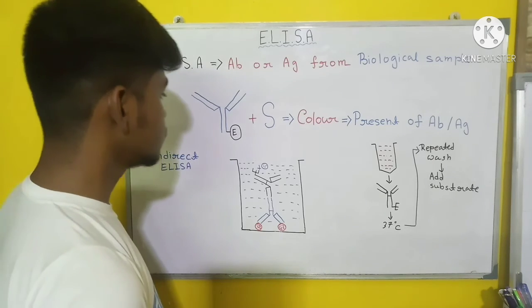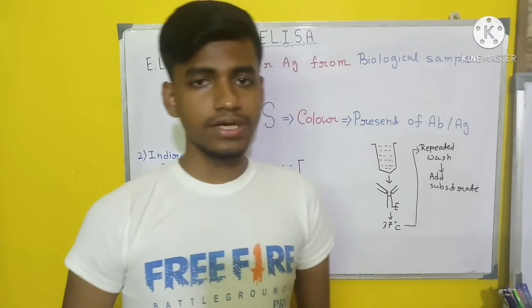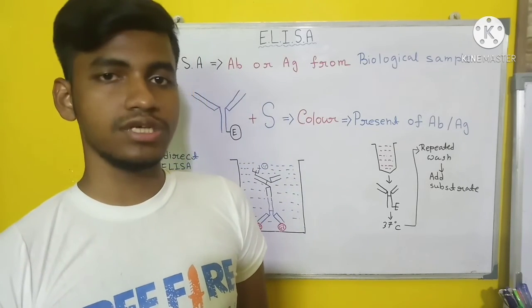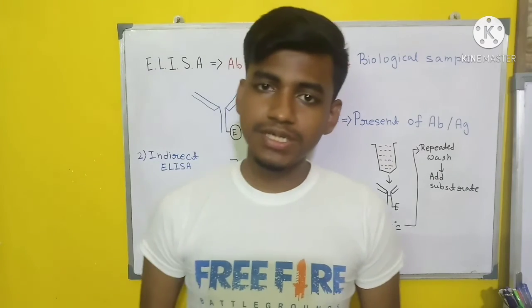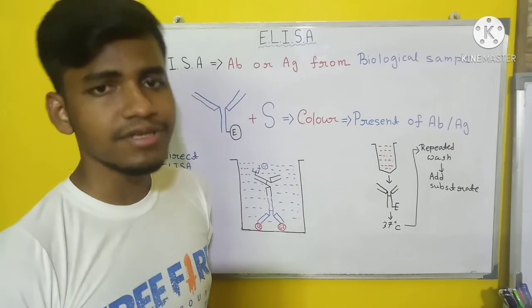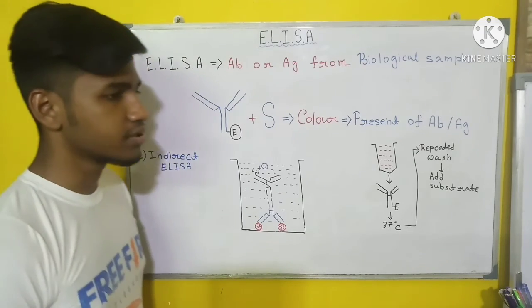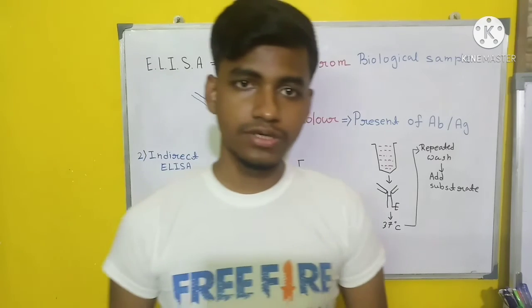So I hope you guys have learned what indirect ELISA is, what direct or sandwich ELISA is, what the basic principle of ELISA is, and what ELISA is, I mean enzyme linked immunosorbent assay. So I hope the concept of ELISA is clear now, guys.